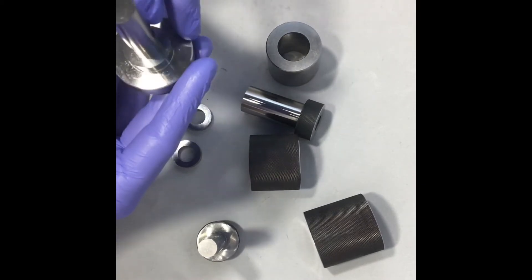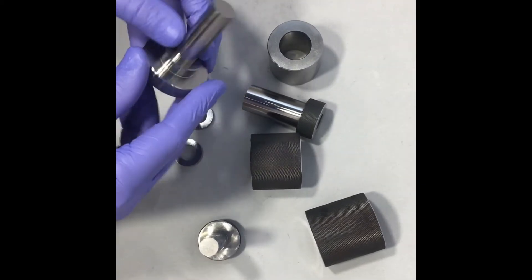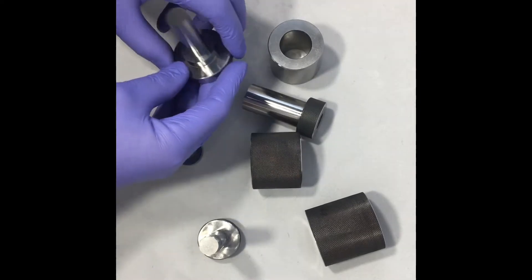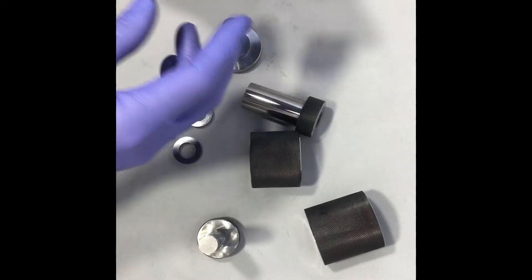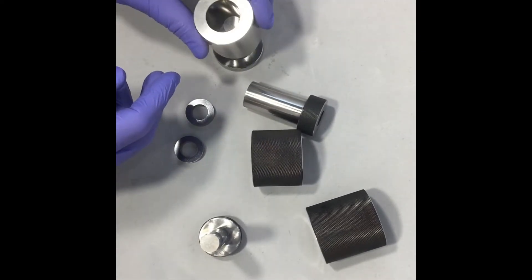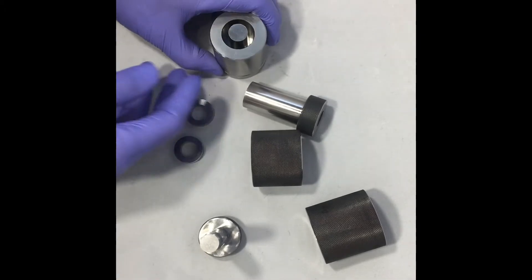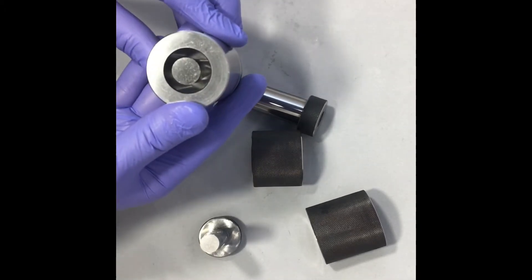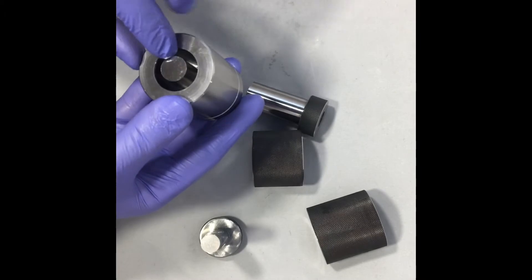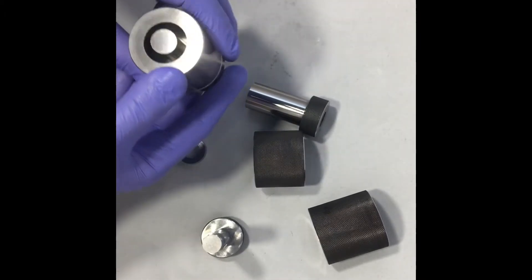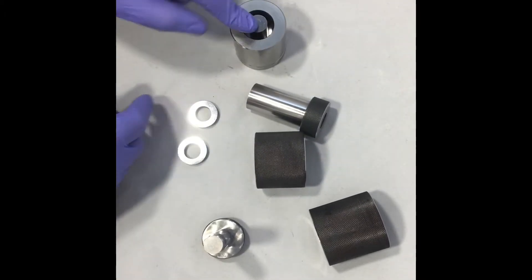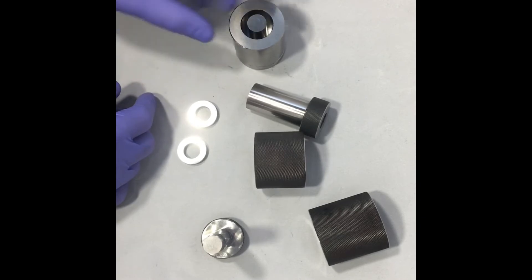This is a 25mm and 15mm set that we've made for a customer. And then after this you put your die sleeve over the top so that makes your ring-shaped cavity here and that's where you're going to put your powder and where you're going to push. No load goes through this central pin.